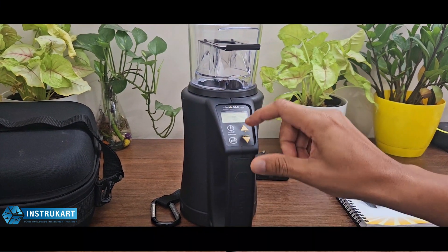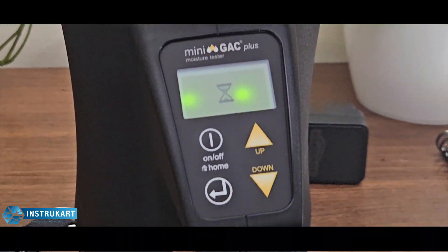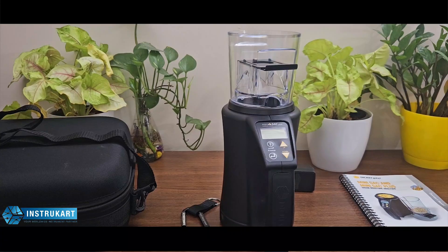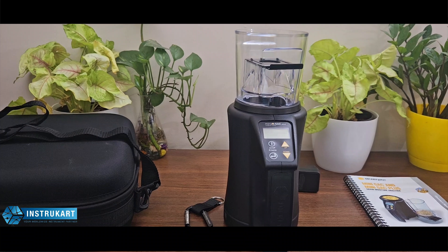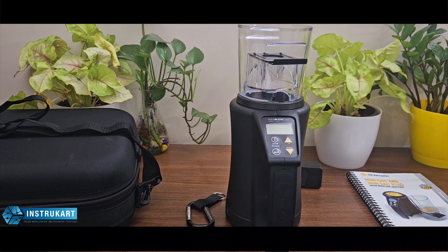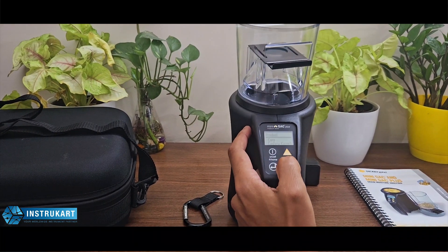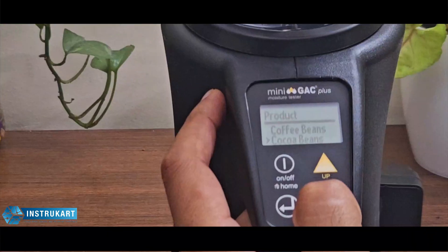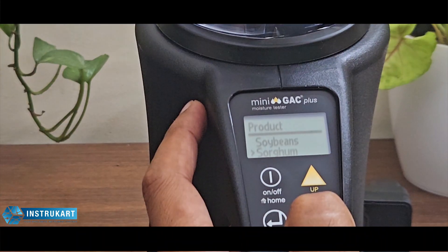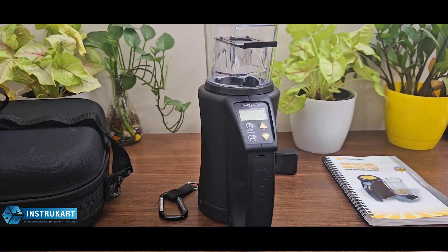It has a front key operation — 4 key operation at the top. One of the best features of this moisture meter is that it measures over 450 types of grain and products, including corn, cashew, coffee, cocoa beans, soya bean, and many other products within that 450 product range.